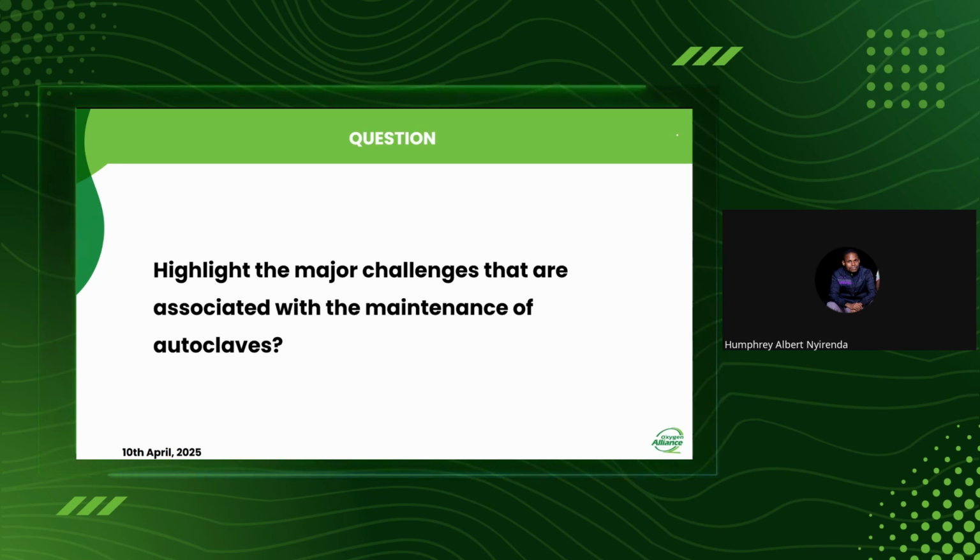So in a scenario where the relief valve did not open, one of the causes of relief valve blockage is impurities within the system. According to the manual or the manufacturer's guideline, there is general cleaning that has to be done either monthly or annually on the autoclave.